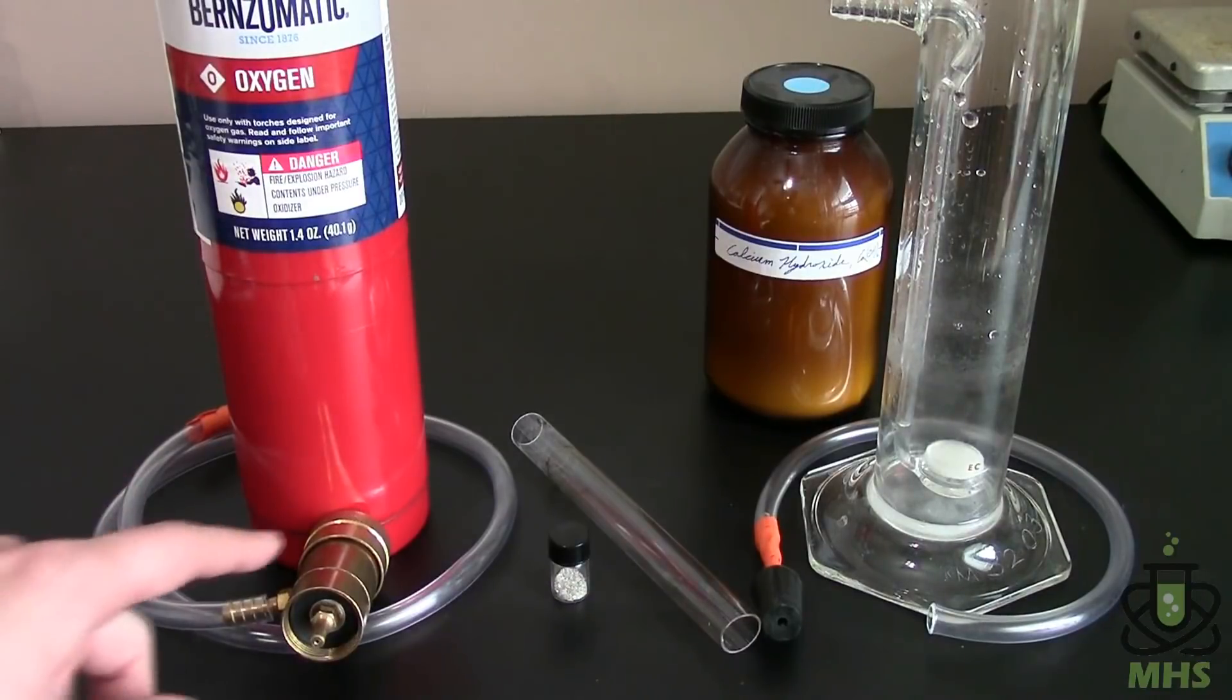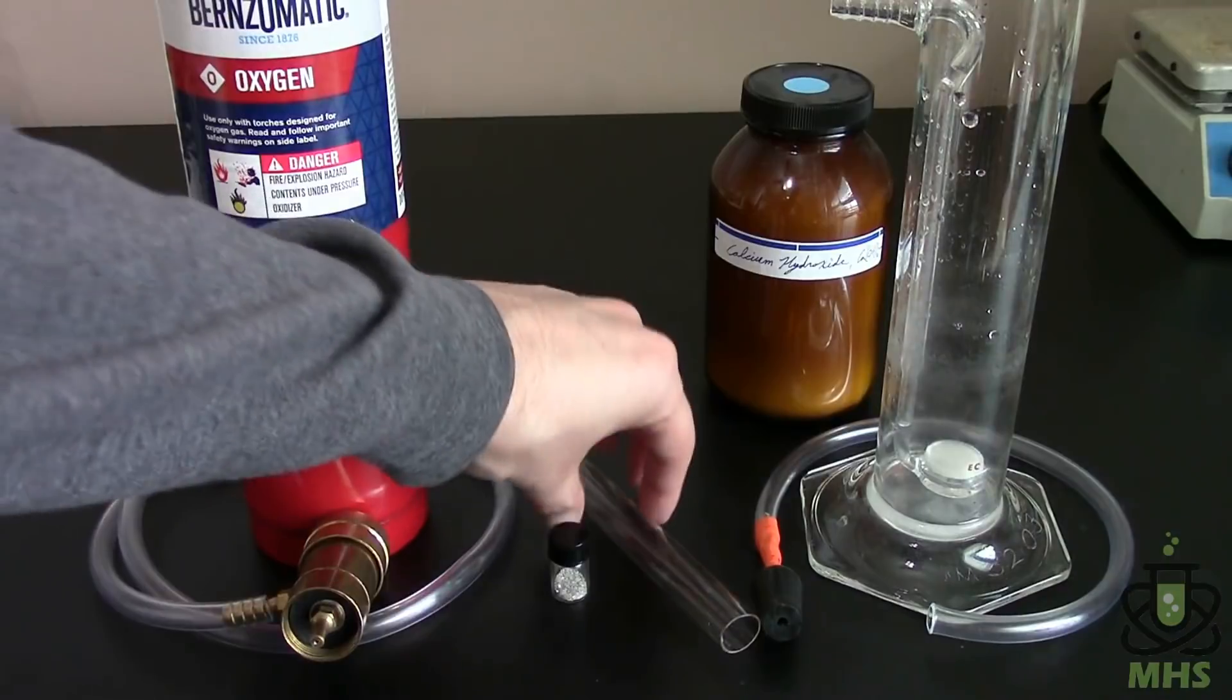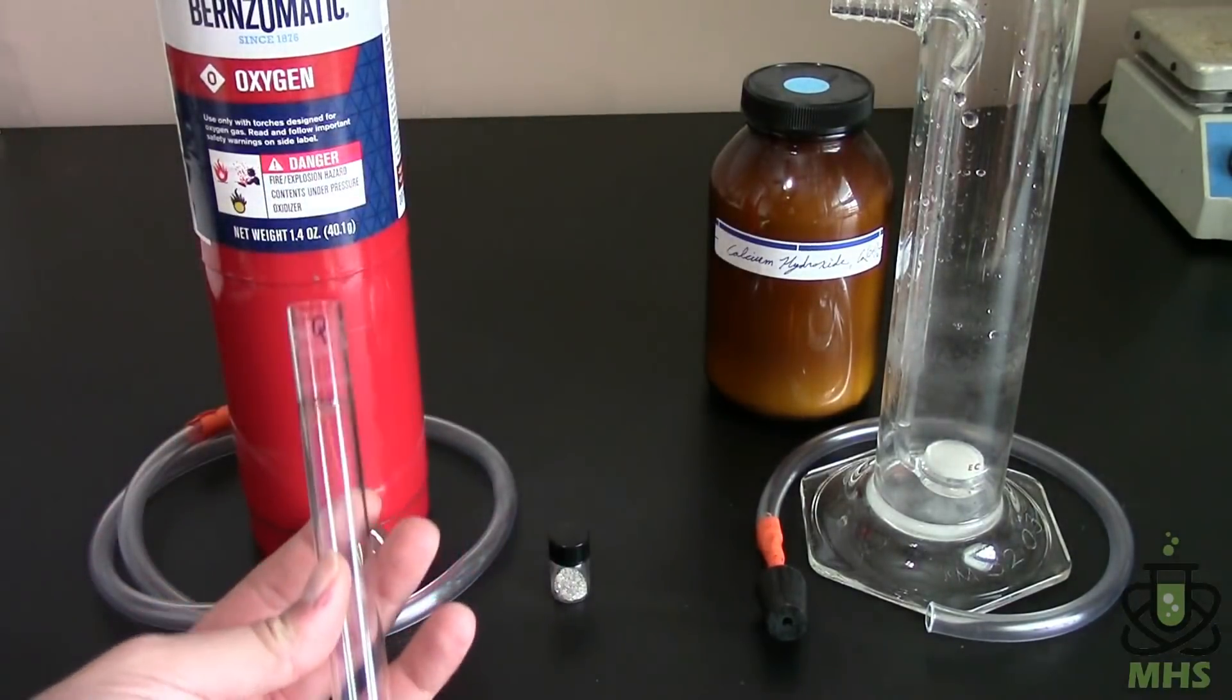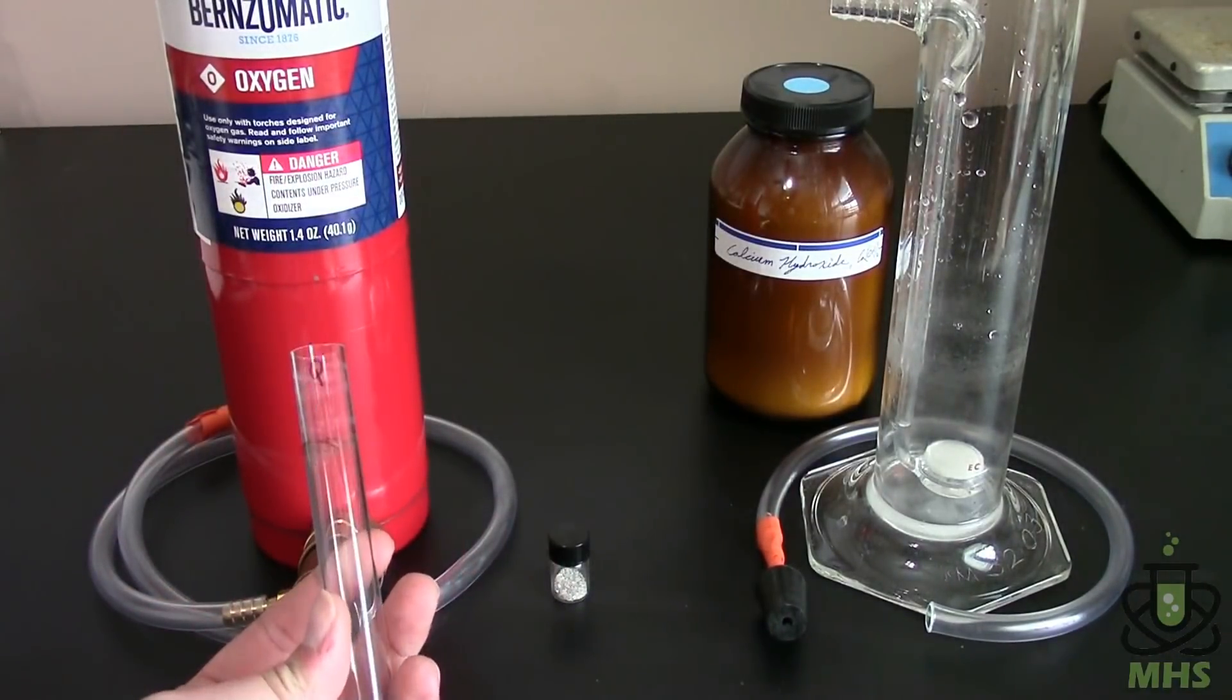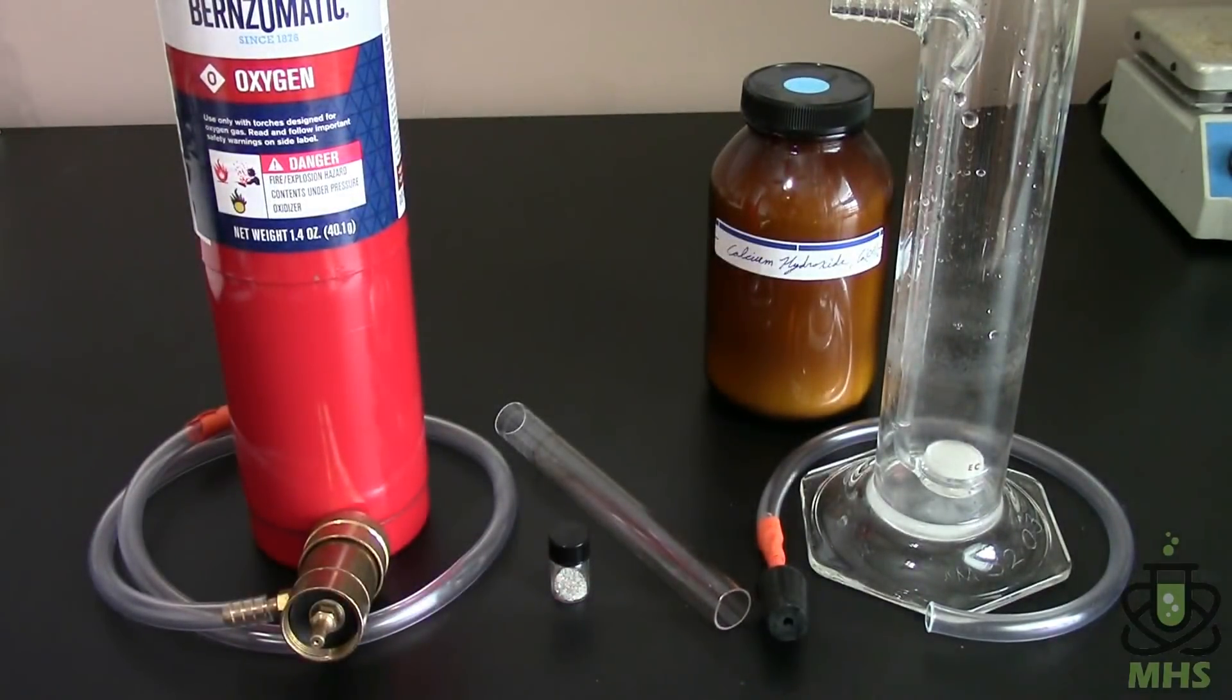So the oxygen is going to flow from the cylinder, come out of the regulator and go through this vinyl tubing which connects to the next piece which is a quartz glass tube. You see I wrote a Q on there for quartz and this is a special piece that you actually do need.